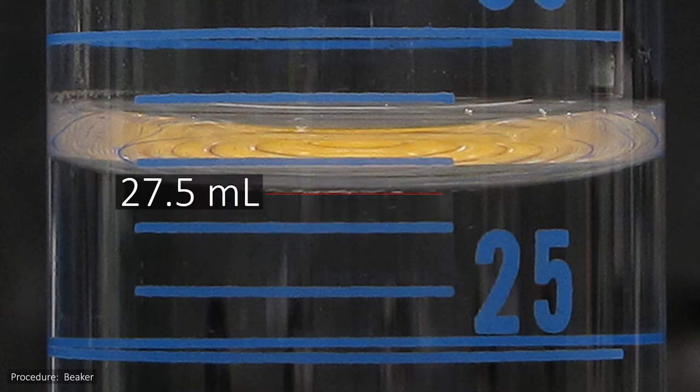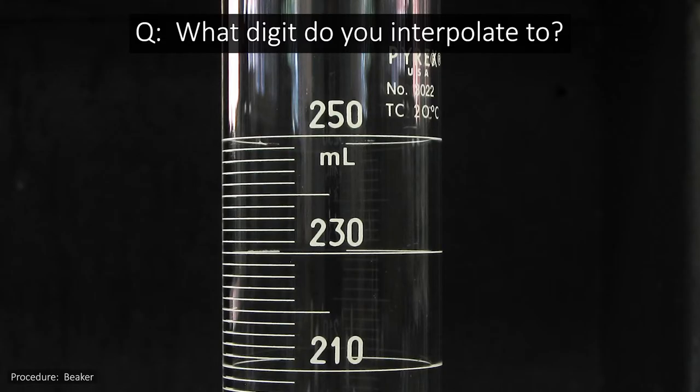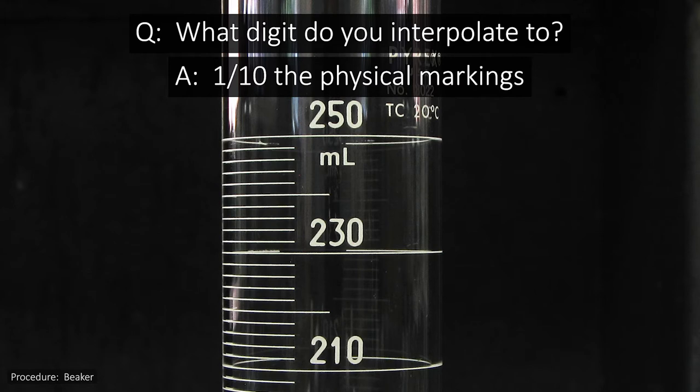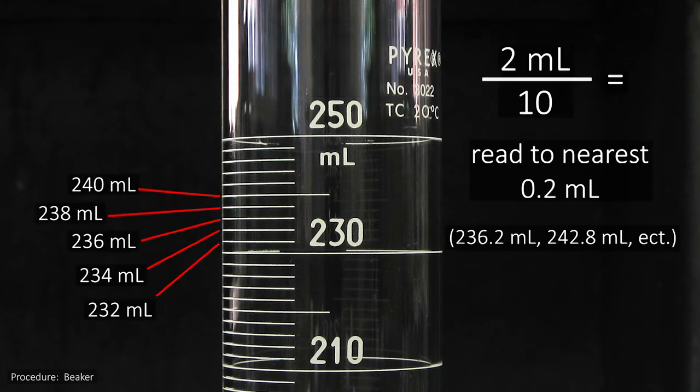so we would read and record this as 27.5 milliliters. If you're trying to read a piece of glassware and you're not sure what you're supposed to interpolate to, just take the actual physical markings on the piece you're working with and divide by 10. This graduated cylinder's markings go up in increments of 2 milliliters, so you would read and record this one to the nearest 0.2 milliliters.